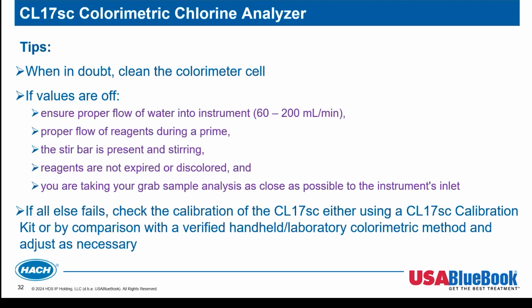So I'll talk about a few tips on what to do if you encounter any issues with your instruments. When in doubt, clean the colorimeter cell. In my experience back in the day as a field service technician, this would solve 9 out of 10 problems with my customers. It's just cleaning our colorimeter cell. And I'm about to walk us through that pretty quick here.